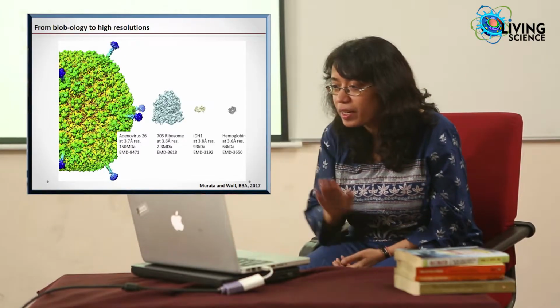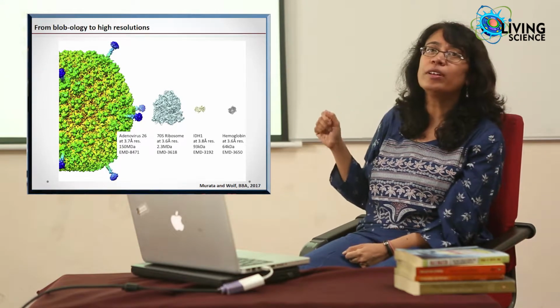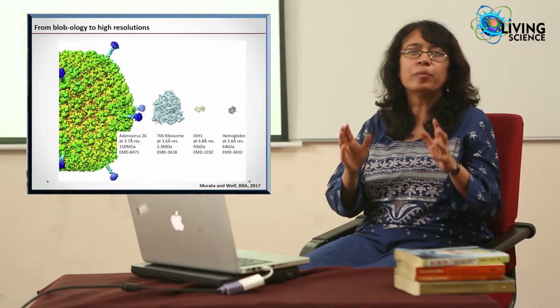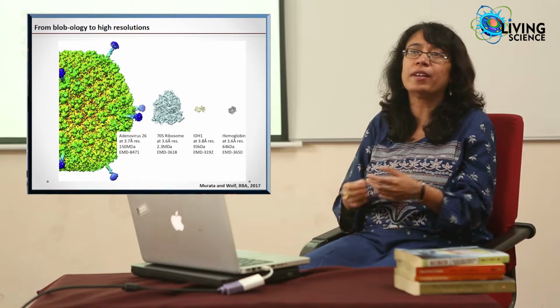And so this is sort of crystallography standard, where you can solve the structure of a molecule without first having to crystallize that molecule. This revolution has converted cryo-electron microscopy from a niche technique, or blobology, to a technique which will lead to the generation of very high resolution structures. Initially, it was limited to very large molecules. Unless you had a large virus or a protein complex above, let's say, 300 kD, it was very difficult to visualize that molecule using electron microscopy.